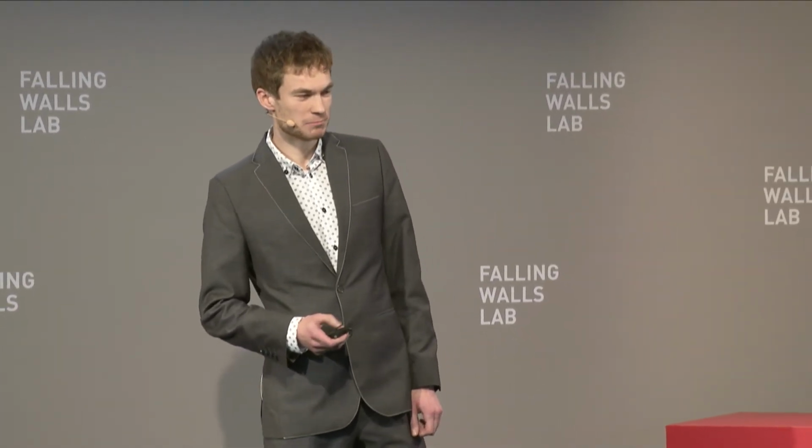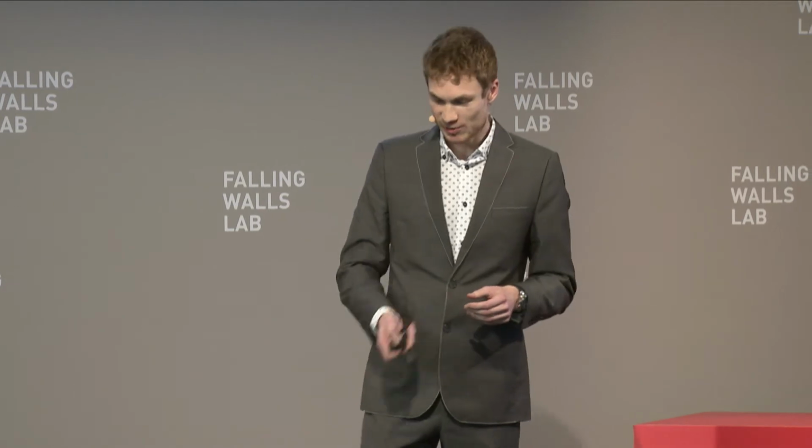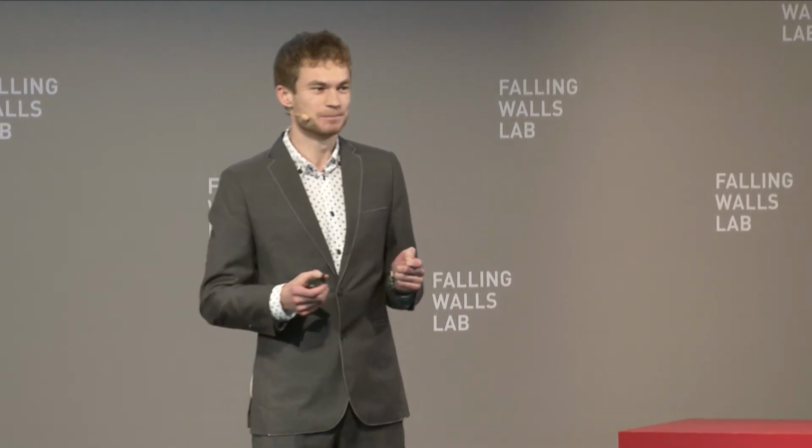So probably most of you have heard about CT devices, right? These days they are commonly used in hospitals, and you can perform a 3D imaging of your chest or your brain, and maybe some of you even experienced this. It looks like this. But sometimes you want to image something that is pretty small, maybe in a millimeter range or even smaller, maybe some cell or some microorganism.